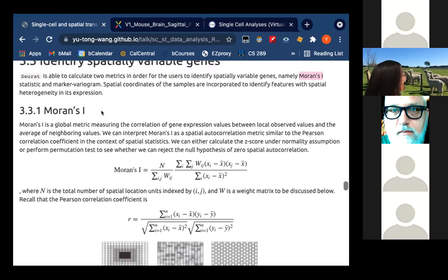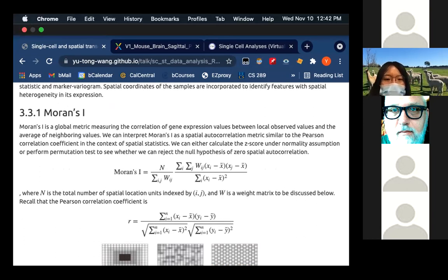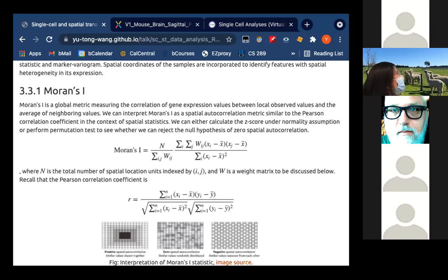Let's take a quick look at what Moran's I is about. You don't have to read all of these words, it's too much here. Okay, there's a chat. Sorry, never mind. Okay, thank you.